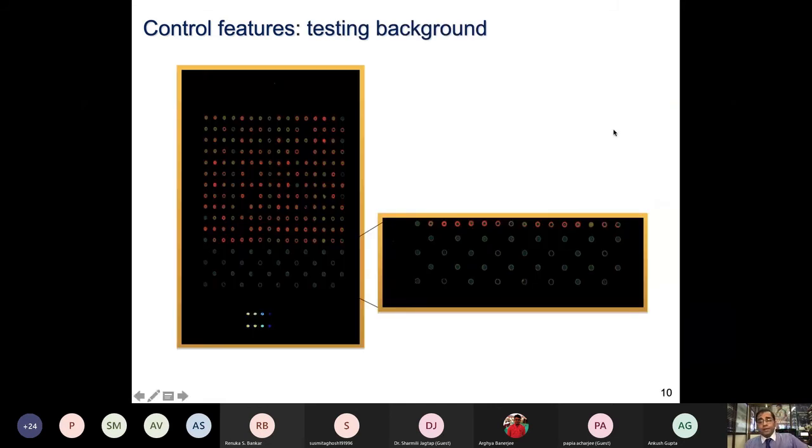Now, if you are looking at IgG response, immunoglobulin, for immunoassays on the chip, you should think about printing some purified IgG with a dilution series from lower to higher concentration. Those will light up, which can help you decide what the immune response was, which can be compared with the proteins expressed on the chip.